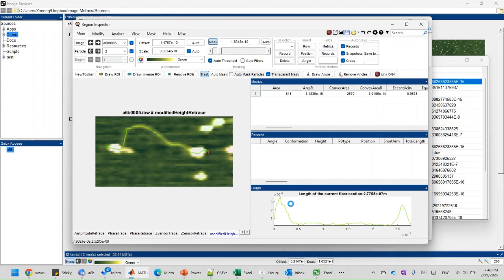Right now, let's repeat the same process. Since this is two pieces, there's one thing for this specific molecule that I did not pay attention to. Let's repeat the same process. You see that the DNA is actually not traced exactly like this, right? There's a bit of DNA here. The DNA basically goes inside, maybe it goes out again. So maybe this is not the end, but this is the end.